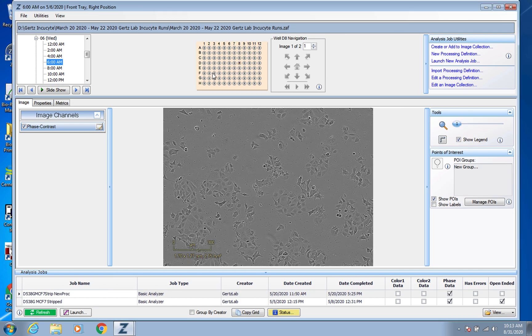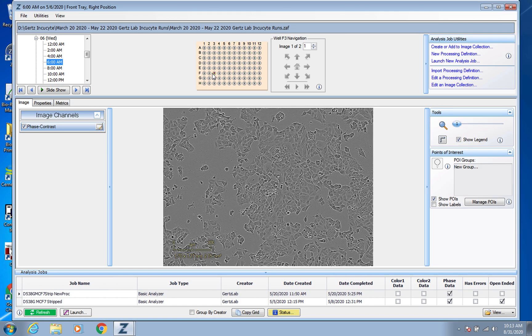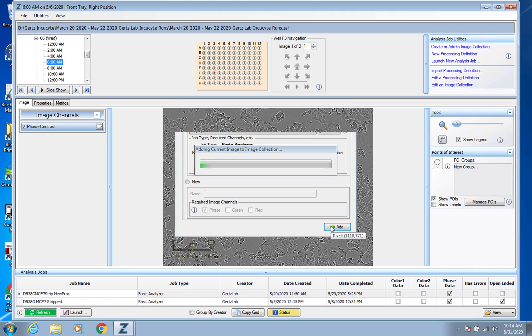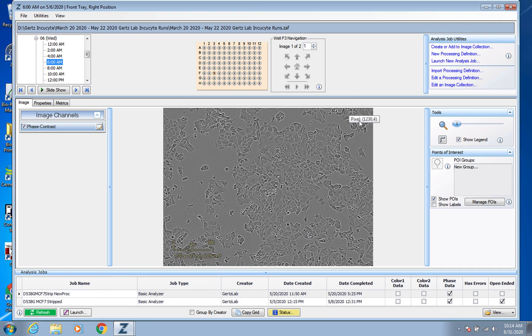So I wasn't paying attention, and I don't know how many I've done. So okay, yeah, this would make eight. So now we've created our image collection, and now we can go into creating the processing definition.